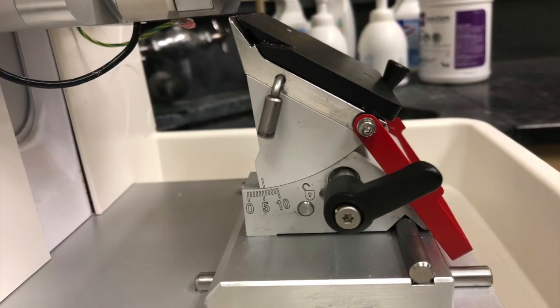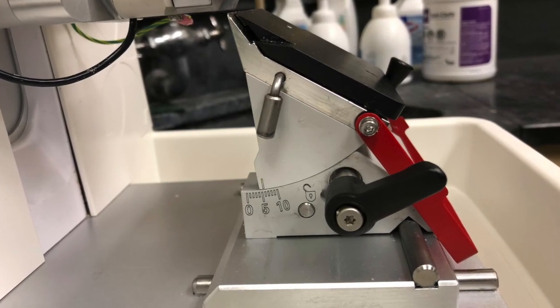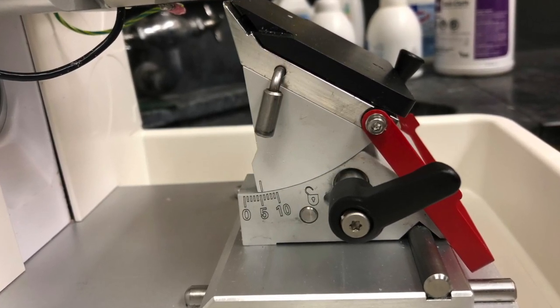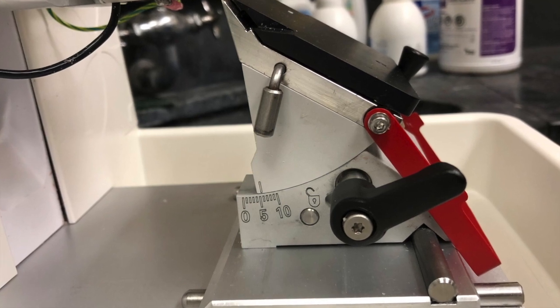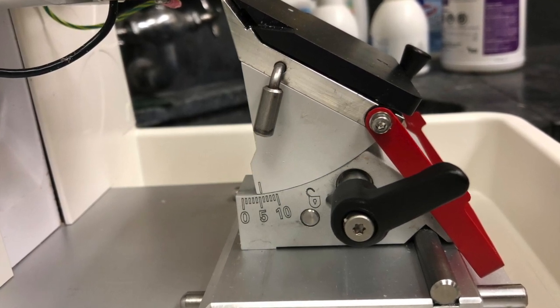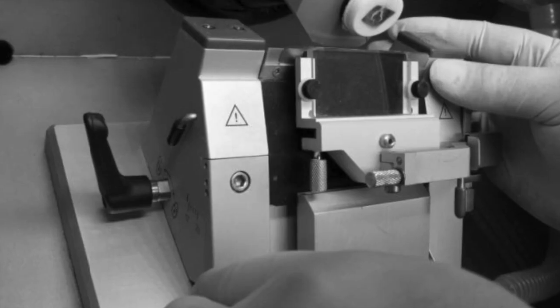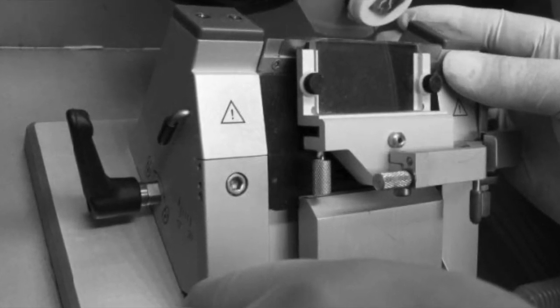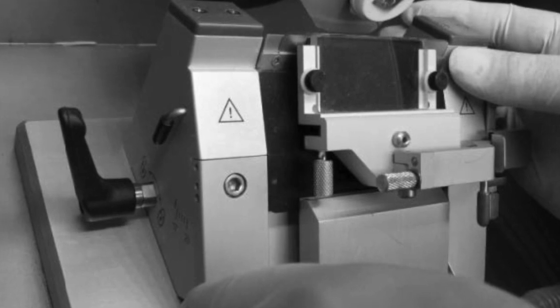One notable exception to this rule are Microtomes and Cryostats built by Sakura. Here's a picture of a current Microtome made by them, and the proper blade angle on that is 5 degrees. Here's another picture of a blade holder from their Cryo-3 Cryostat, where the proper angle on that is 18 to 25.